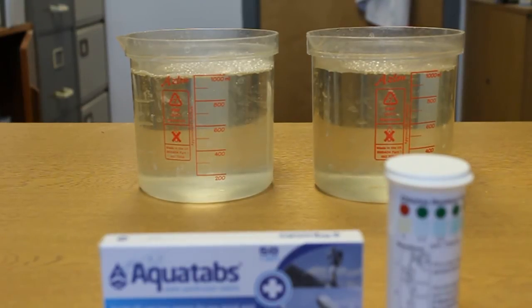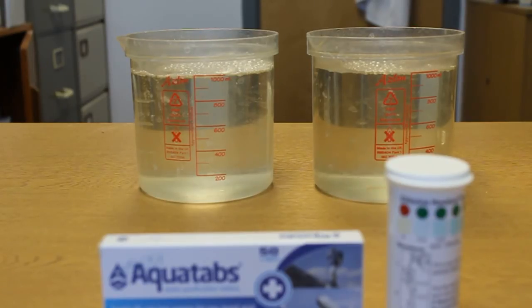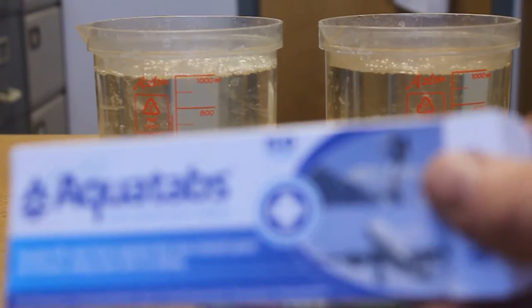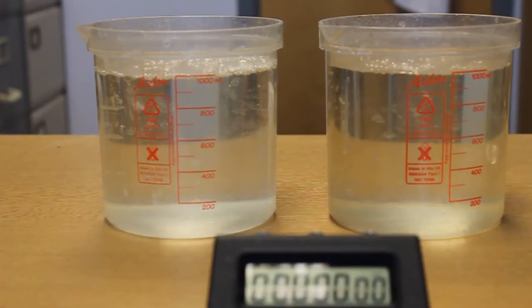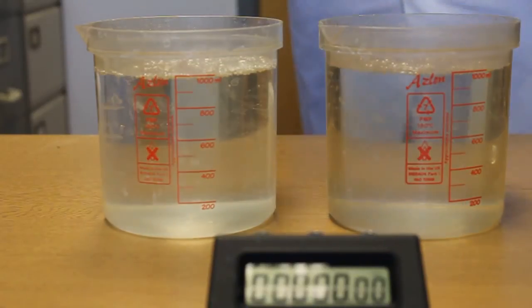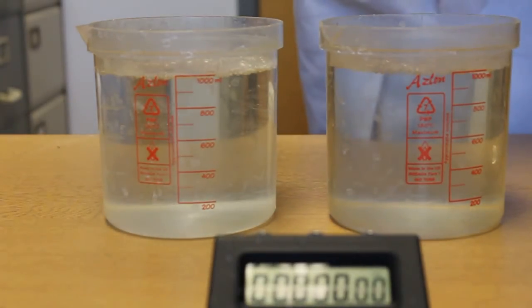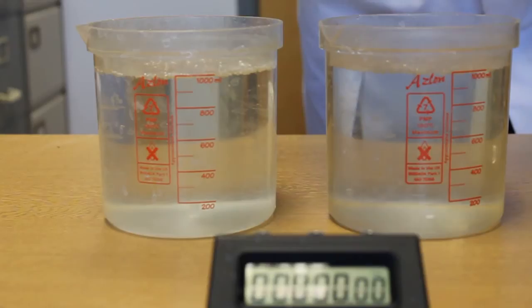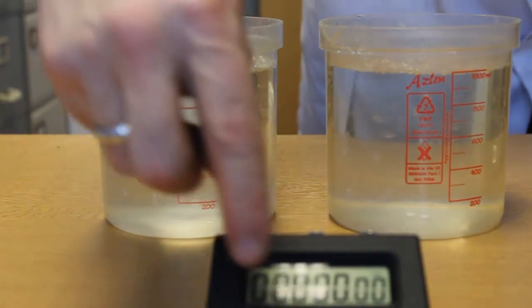Having filled the samples you can now add the Aquatabs water treatment tablets. Next we will add the Aquatabs tablets to the samples and start the reaction. Tablets are in strips and can be torn off. In this case we will put one tablet in here, which is sample 1, and we will put two tablets in here, sample 2, and start the timer.